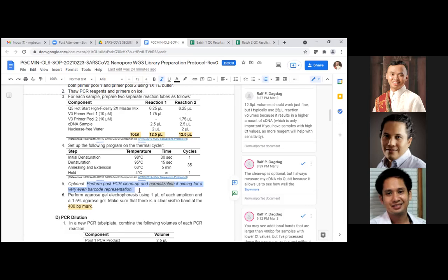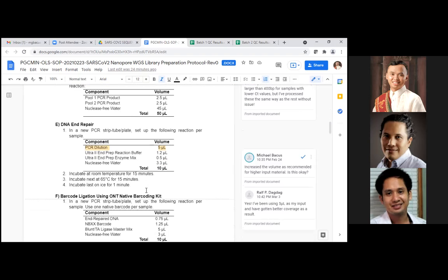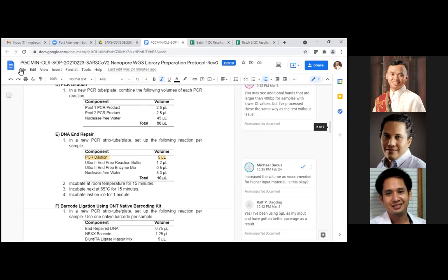But it's quite difficult to do that using the standard gel and PCR amplification cleanup kits, because they usually only remove very short segments and very long segments, like the genomic DNA contamination and the primer dimers. So I think you would need to explore another method for that. But so far, we haven't experienced that yet. Okay.